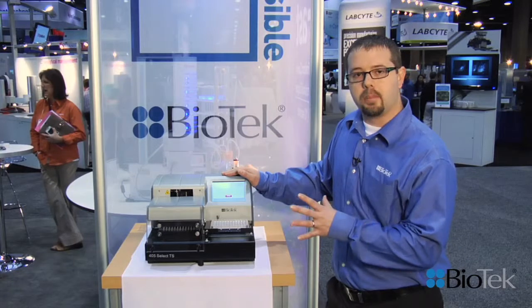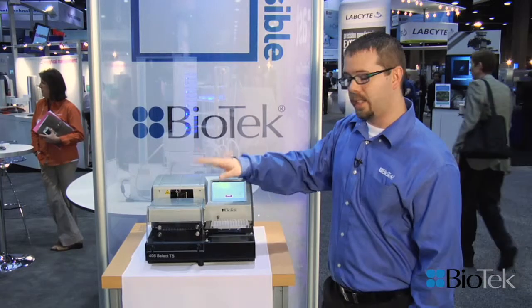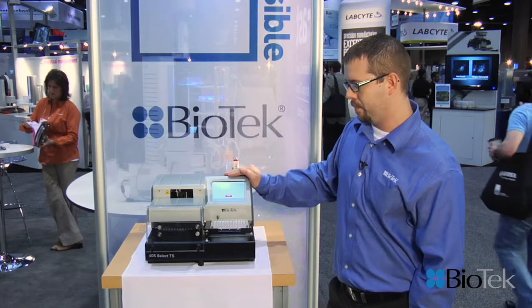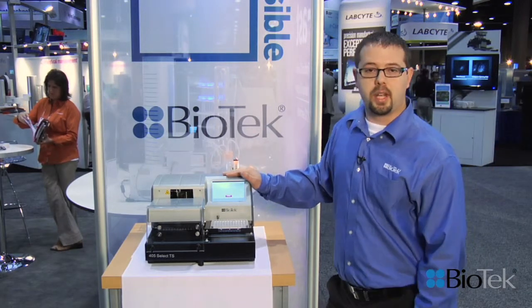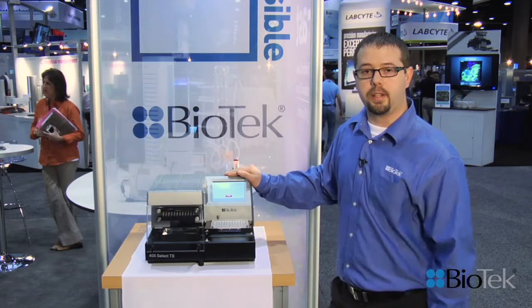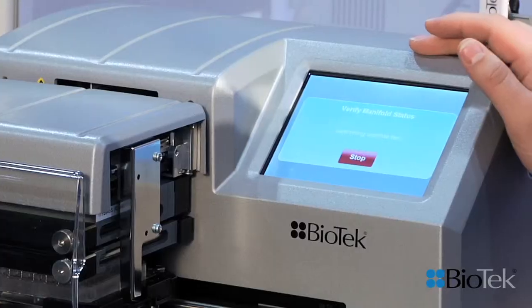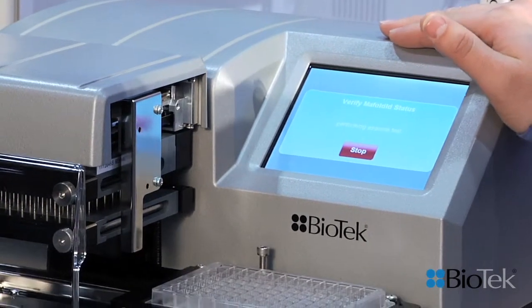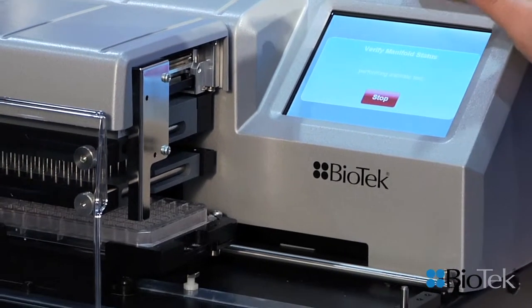So now the system has a complete way to detect clogs, clean clogs, and maintain your system properly. The software has been designed to be as user-friendly and intuitive as possible and it's very visually driven. If any clogs are detected, they'll be highlighted in the software in red and an explanation of the clog will be given in the software.